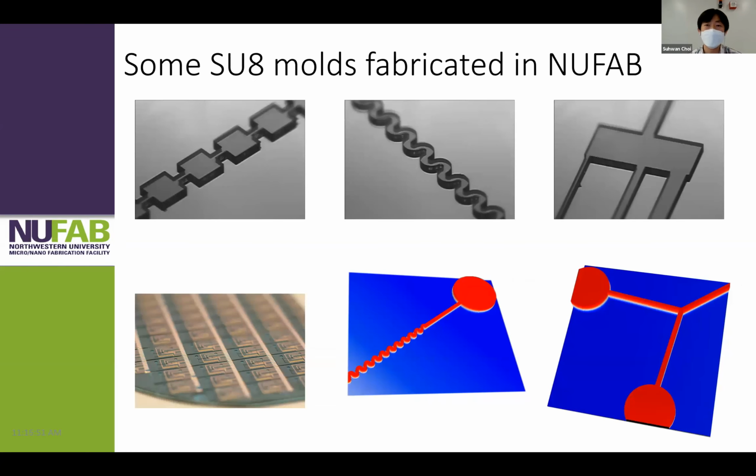And some of the molds fabricated here in NUFAB, we use SU8 mold as a microfluidic channel. And then at the bottom, the cartoon image is made by Zygo. So whenever users want to make the kind of 3D mapping, then they can do it by using Zygo.